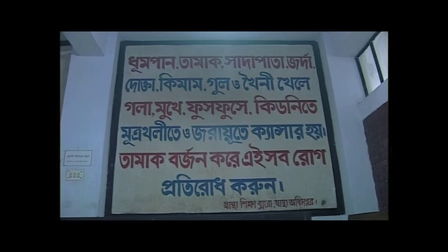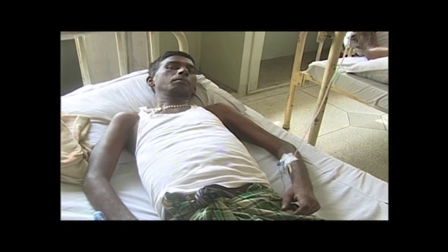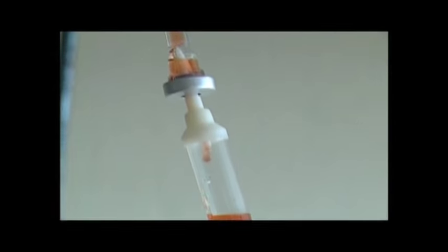Beacon Pharmaceuticals, as a worthy warrior against cancer, is the first high-tech lyophilized anti-cancer drug manufacturing facility in Bangladesh.